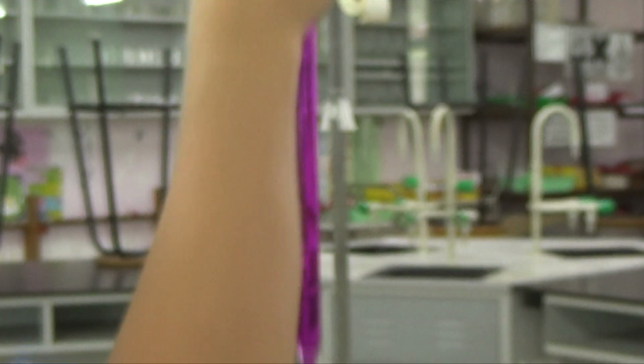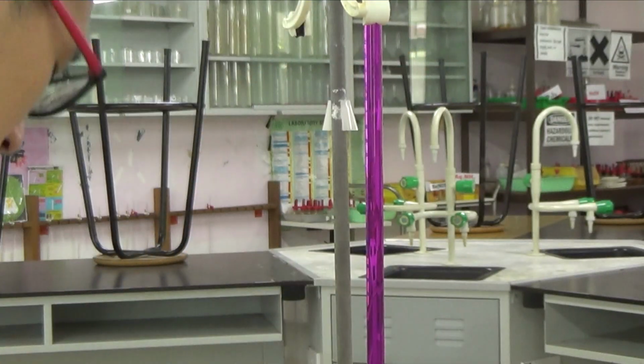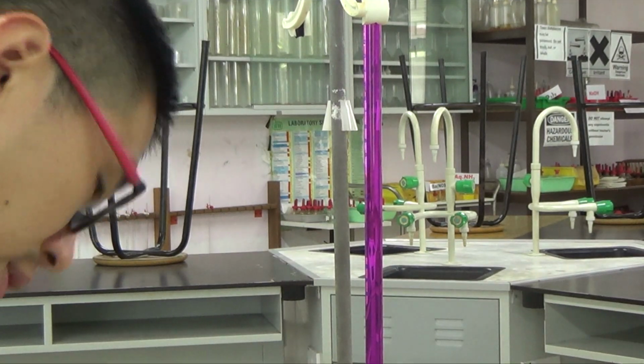So that is 17.0. So let me just make this upright. So 17.0 there. So reading above the meniscus, 17.0 cm3. Alright, so 17.0 is where I'm going to start.